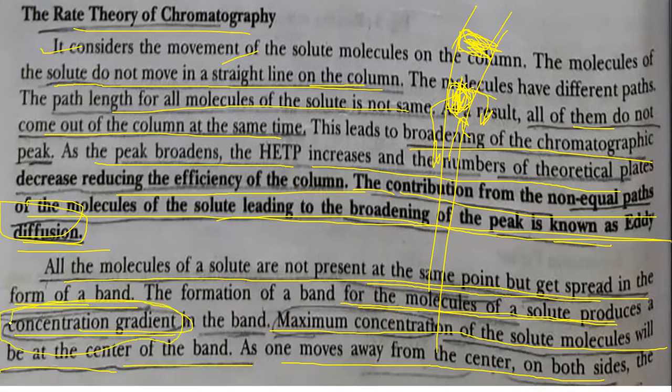तो बँड जो आहे तो काय करतोय, कॉन्सन्ट्रेशन ग्रेडियंट क्रिएट करतो आहे. Maximum concentration of solute molecule is at the center of the band. Okay, as one moves away from the center on both the sides, आहे ना, ह्या सेंटरला जे आहे त्यांचं कॉन्सन्ट्रेशन काय असणार आहे, त्या मॉलिक्यूलचं मॅक्सिमम असणार आहे. कुठे, या पोर्शन मध्ये जास्तीत जास्त कॉन्सन्ट्रेशन असणार आहे. आणि कडेला काय होणार आहे, ते कॉन्सन्ट्रेशन कमी होतो वरती किंवा खाली. ओके, this is called as a concentration gradient.